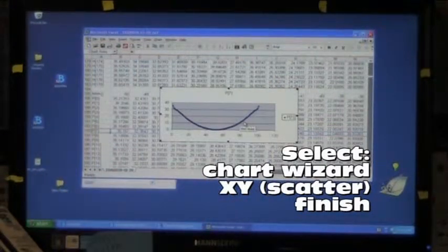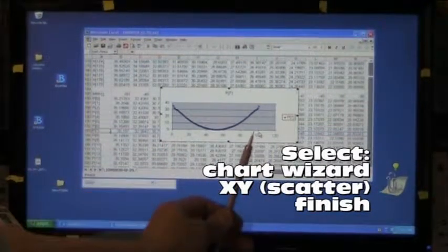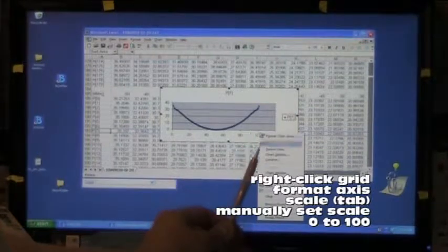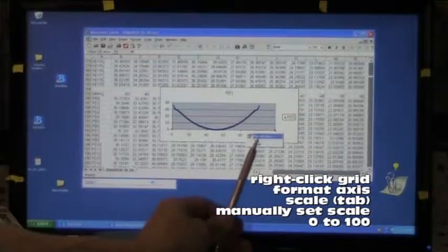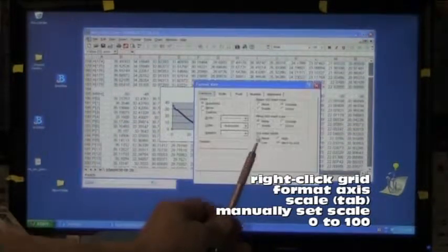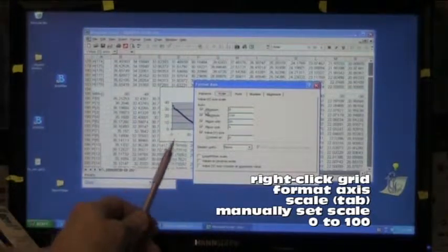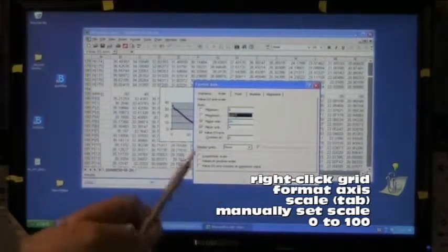I'm going to fix the chart by right clicking the grid at the bottom. Format axis, scale, uncheck the auto boxes and set the scale from 0 to 100.